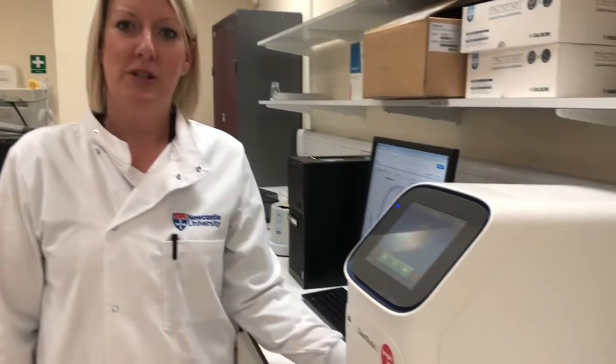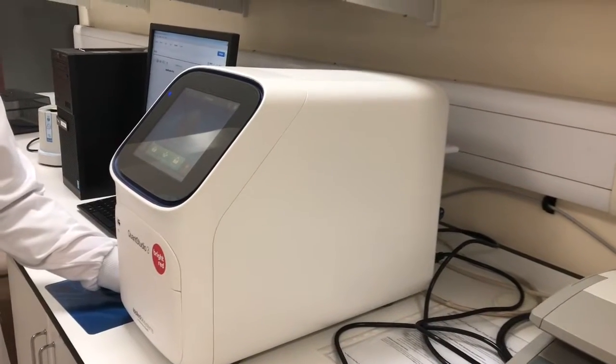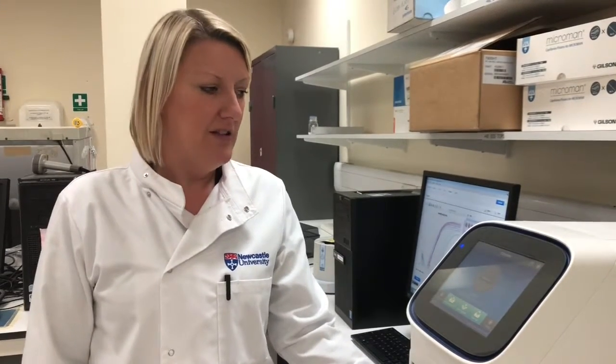So today I'm going to show you our new quantitative real-time PCR machine that was bought with funds from Bright Red to help us with our research here at Newcastle University. It's a Quant Studio 3 PCR machine by Applied Biosystems, and it's a quantitative PCR machine, which basically means in real terms that it measures the amount of gene expression in genes in our DNA and tells us how much of that gene is in those cells, and we can then compare that to the expression of genes in the healthy control samples. And then that amount of gene expression can tell us what might be going on with those patients and how we might use that to find out more information about their blood cancer.